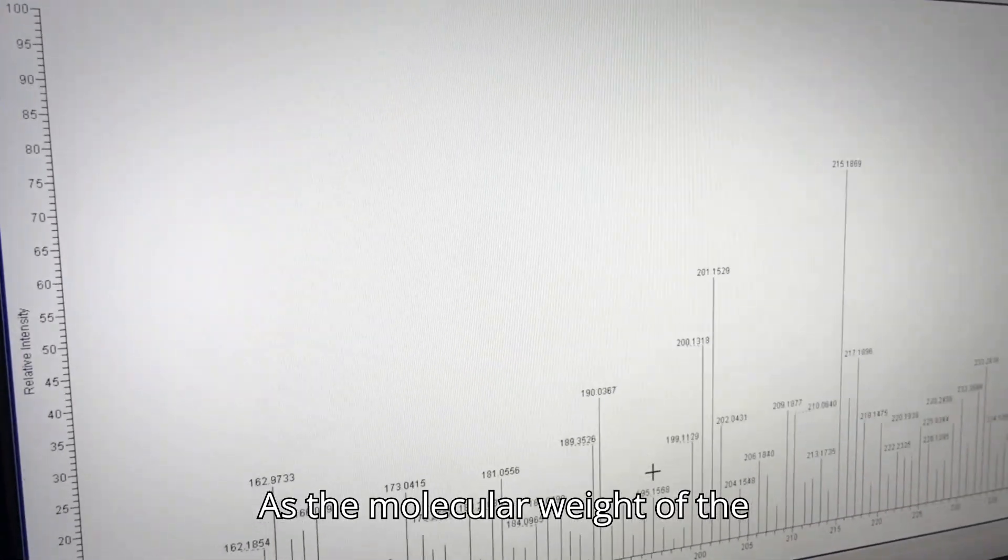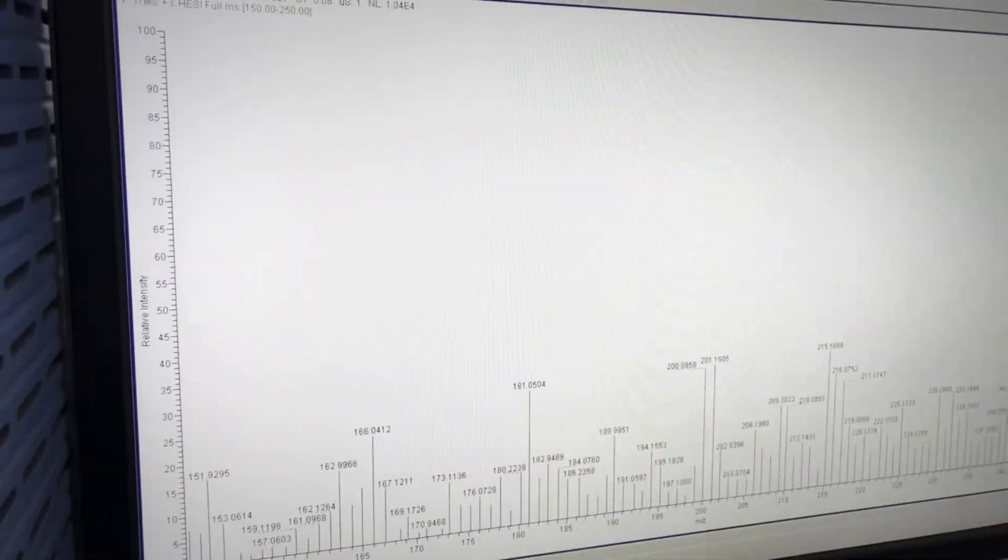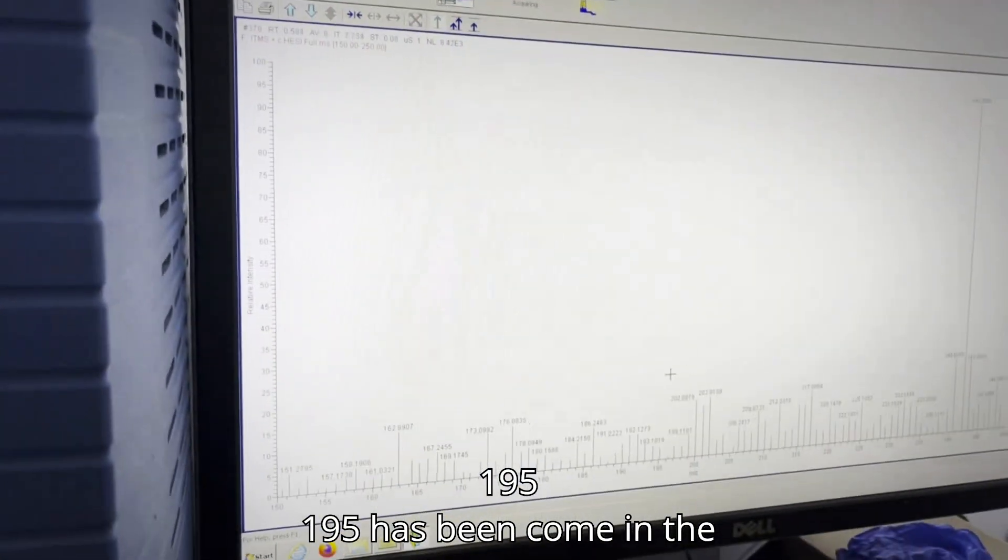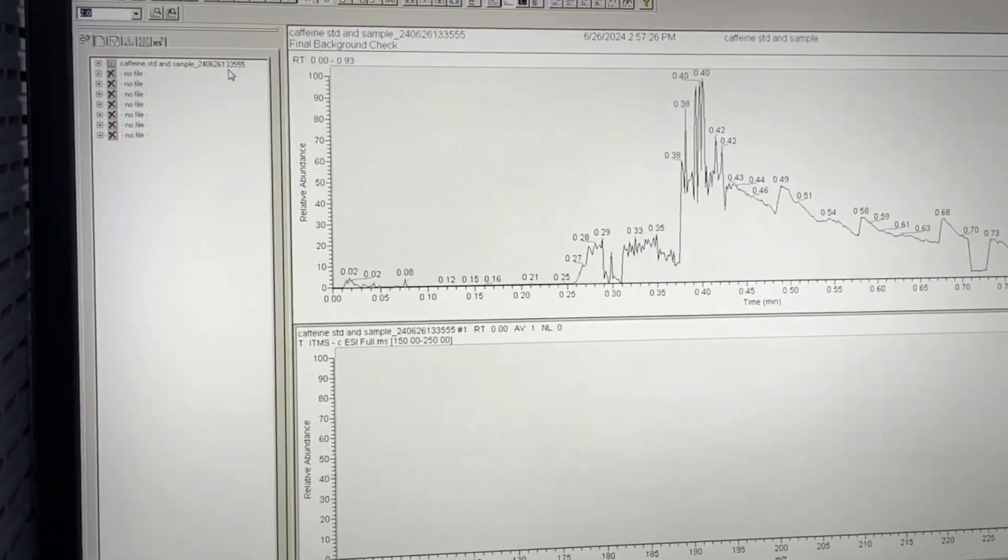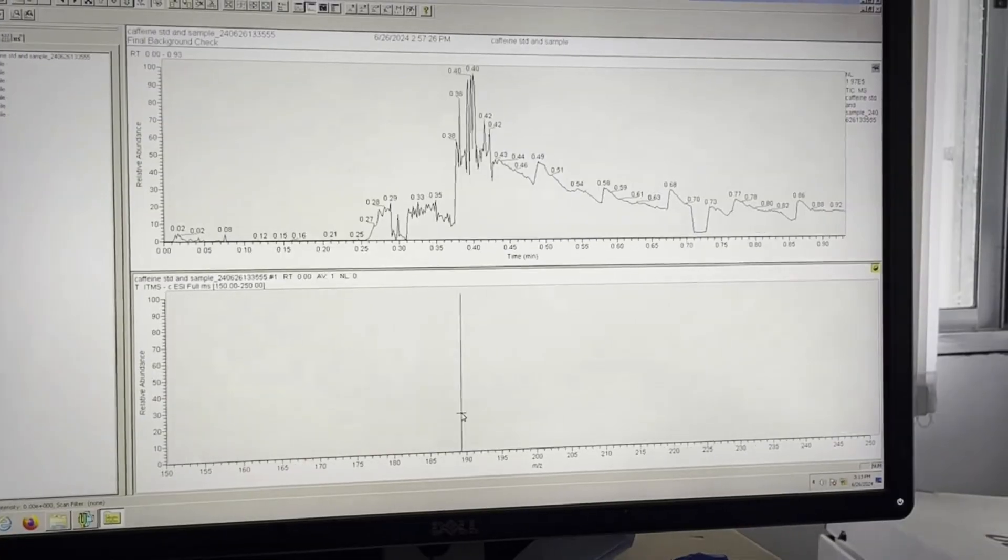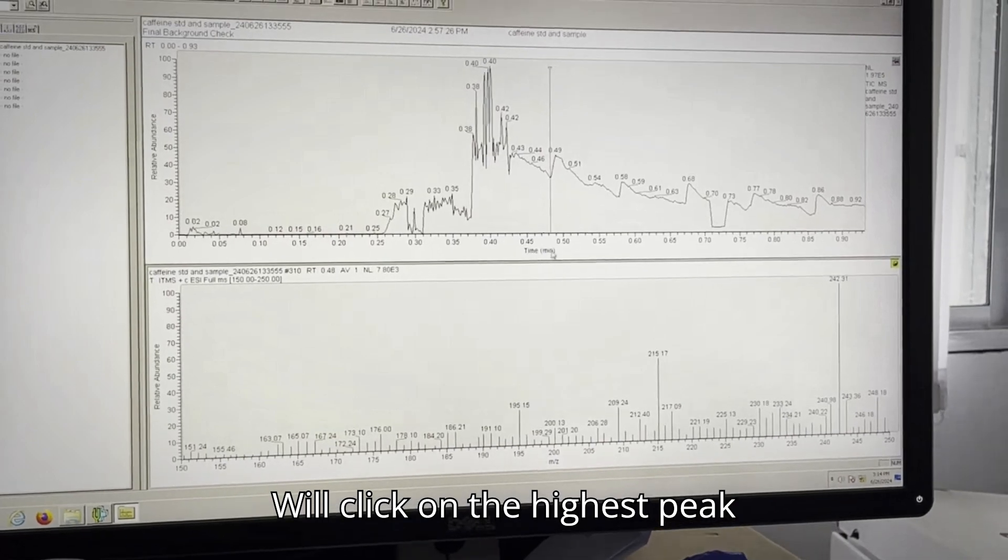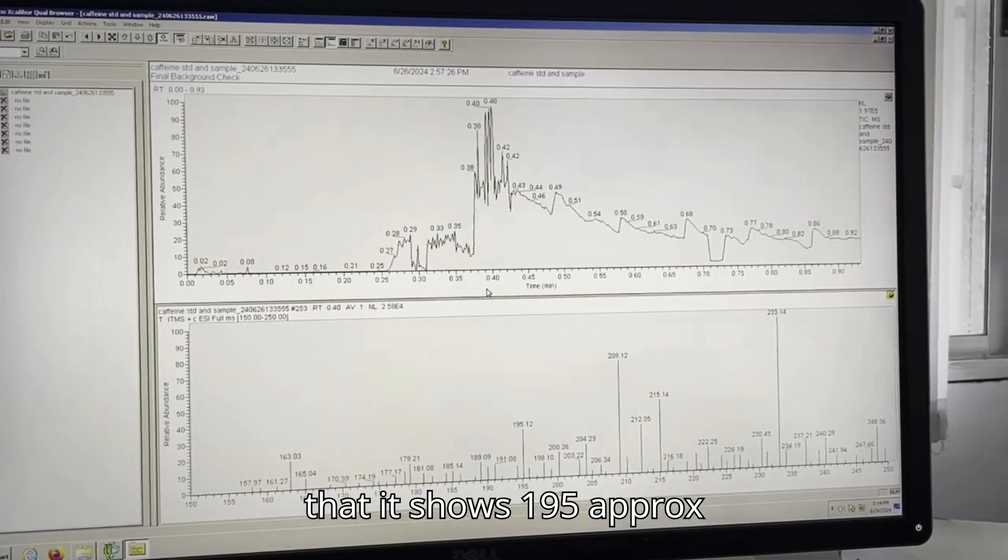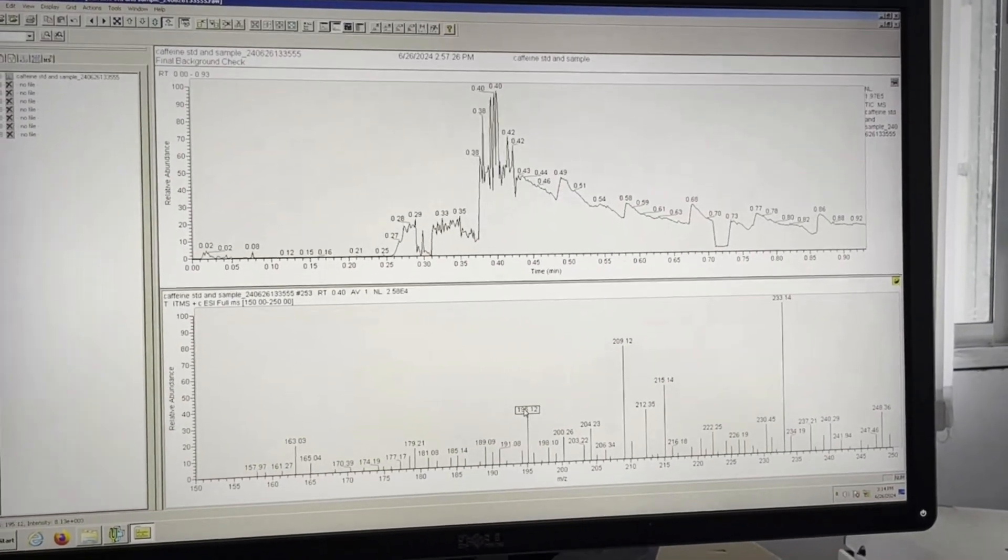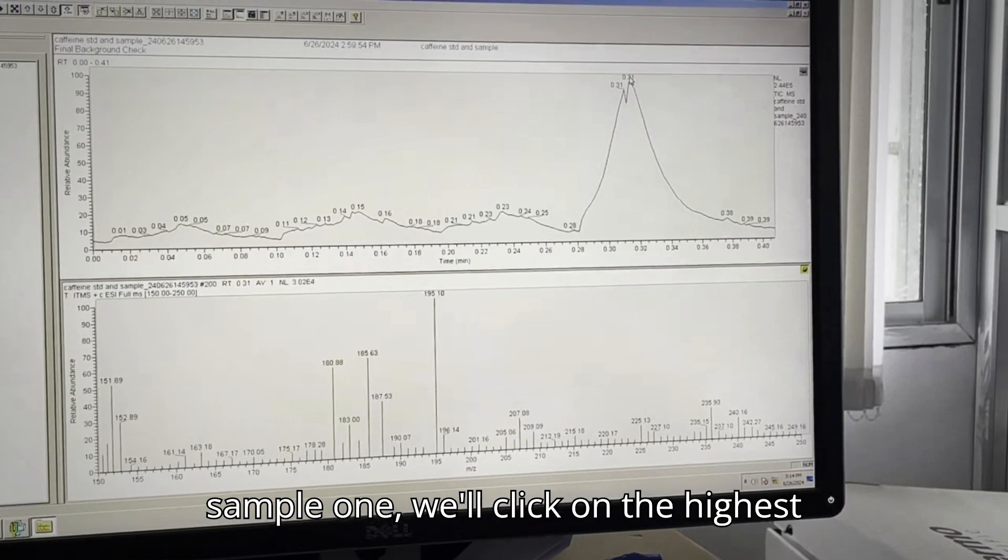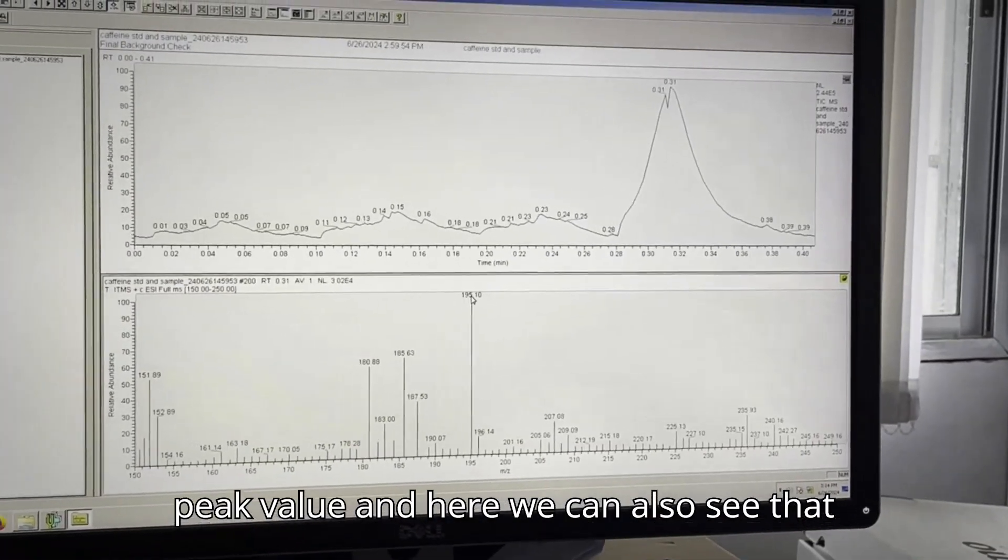As the molecular weight of the caffeine is 194, here we can see the peak, one approximately 195 has been come in the positive way. After that, we will analyze the standard peak. We will click on the highest peak value. And we can see in the computer screen that it shows 195, approximately 195 over there. Here we will visualize for the sample one. We will click on the highest peak value. And here we can also see that the value.